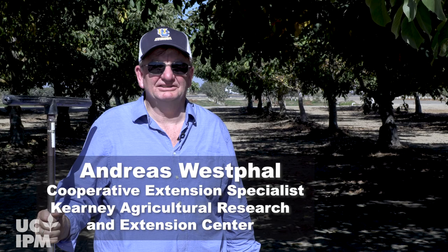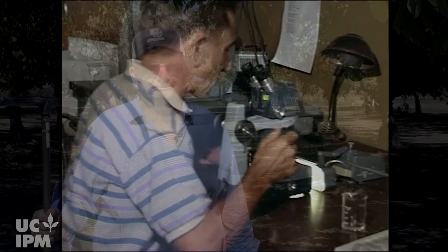Hi everyone, I'm Andreas Westphal. I'm an extension nematologist at the Kearney Agricultural Research Center. I'm going to show you some procedures on how to sample soil and roots for nematode detection. Numbers developed from that can then be used for your management decisions either in walnuts or also in almonds.